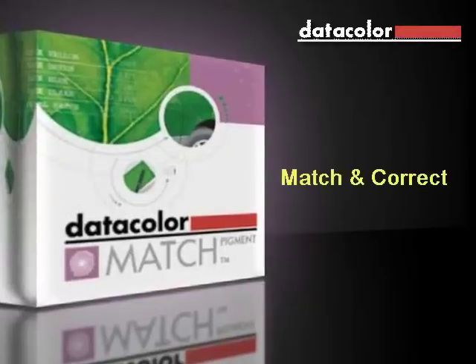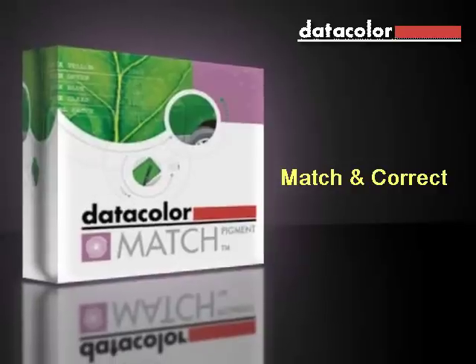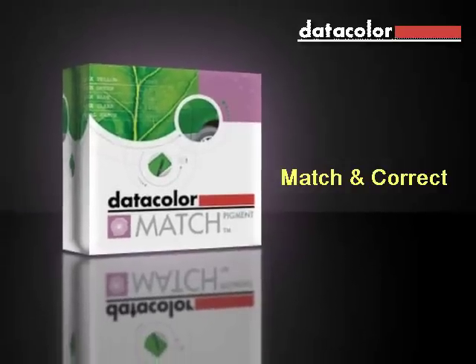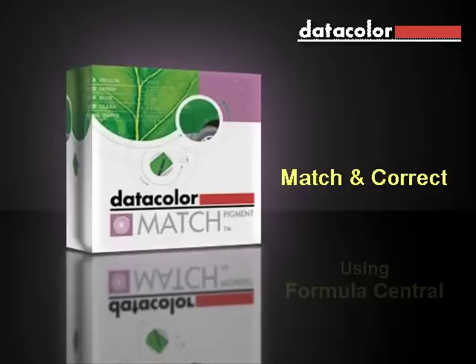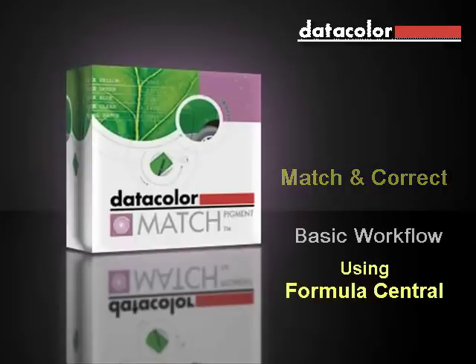Hello and welcome to this series of video tutorials on using Datacolor Match Pigment for matching and correcting color. In this video, I'll give you a quick tour of the color matching module, Formula Central. Then, I'll show you a reliable workflow that can be expanded easily and help you get the best results quickly.